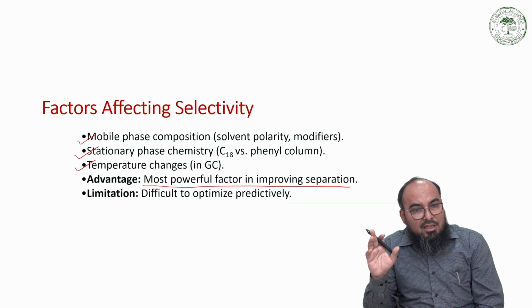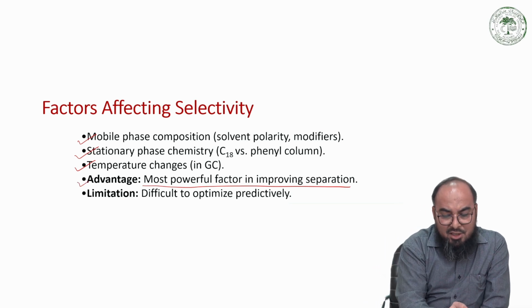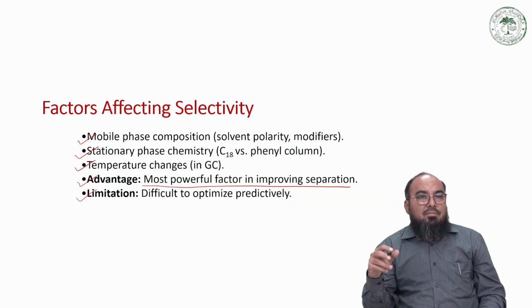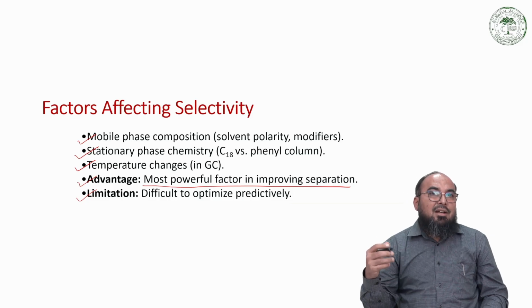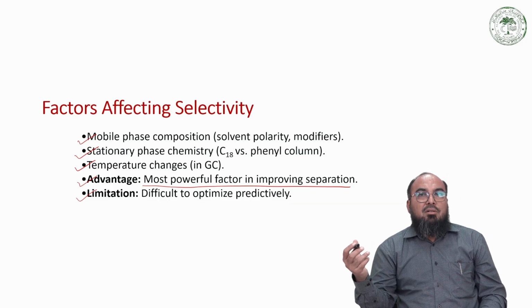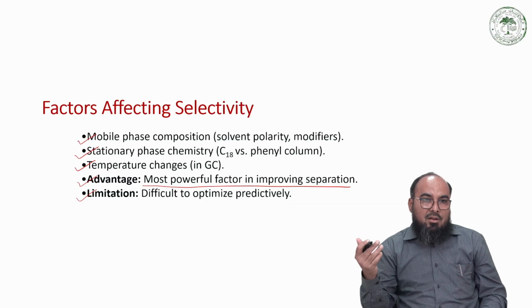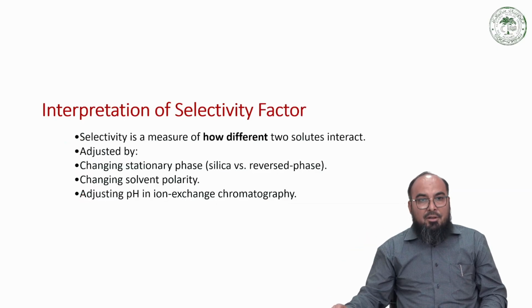And the limitation is that it is difficult to optimize predictively. Initially, you cannot say whether it is going to have a good separation or not. So you have to run a chromatogram each time. Otherwise, you cannot say anything about it.